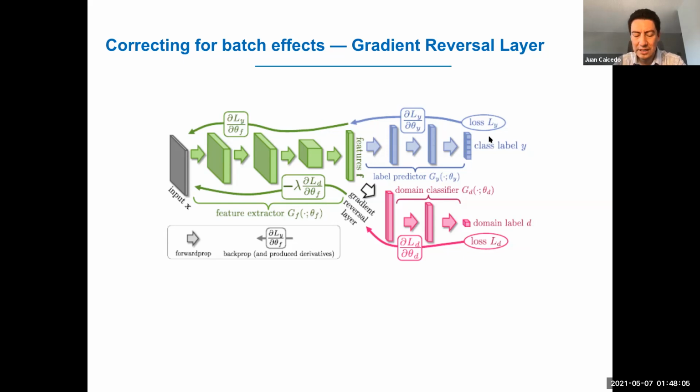The first head classifies the compound because it's something that we can use for learning features. The second classifier determines the batch, and we don't want this information to influence the features that we use. So we use the negative information of that gradient in order to destroy any potential information that comes from the image and is associated with the batch.